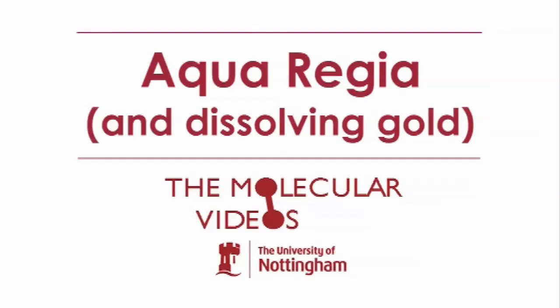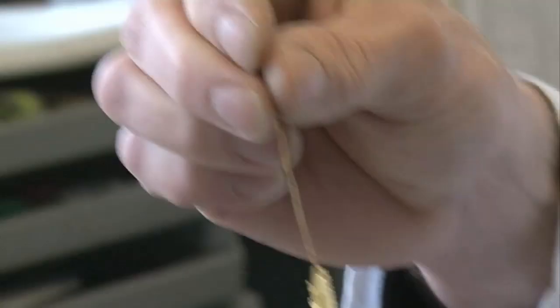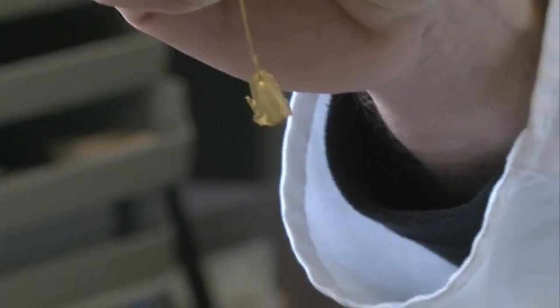Aqua regia, royal water, is a mixture of two acids: hydrochloric acid and nitric acid. The reason it's called royal water is because it dissolves gold. Gold has fascinated people for thousands of years because it doesn't dissolve in anything, doesn't tarnish, always looks nice and shiny — and this was a material that could dissolve it. So it was really something, the lion of the acids, like the lion of animals, king of the animals.